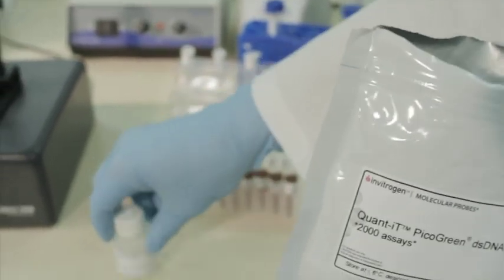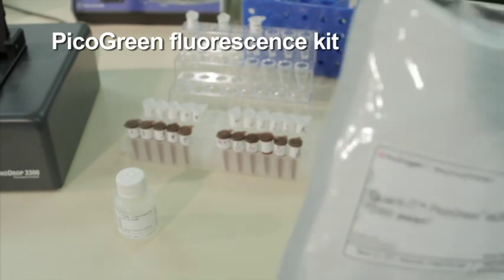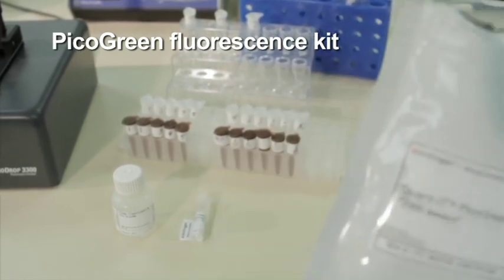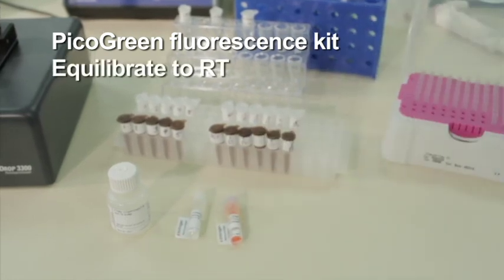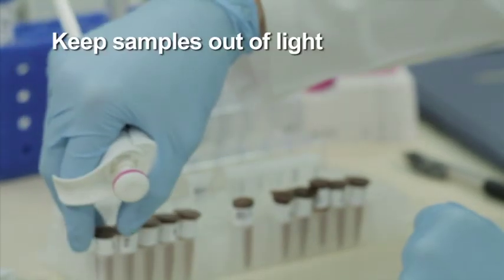To demonstrate high-sensitivity microvolume nucleic acid quantitation using the NanoDrop 3300, a pico-green fluorescence kit is used. To begin, equilibrate the kit's standards and all nucleic acid samples to room temperature. Fluorescence samples are light-sensitive and should be kept in amber or aluminum-wrapped tubes.